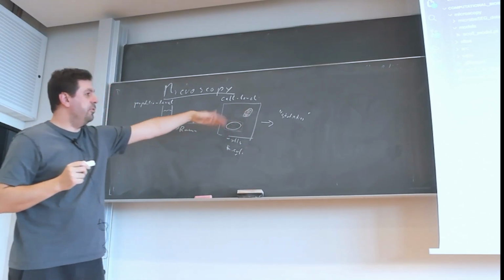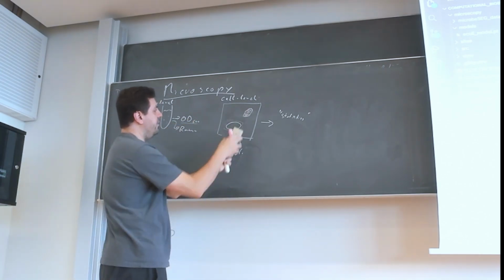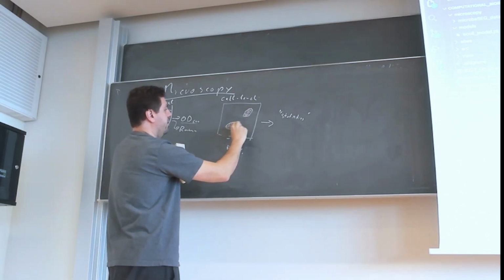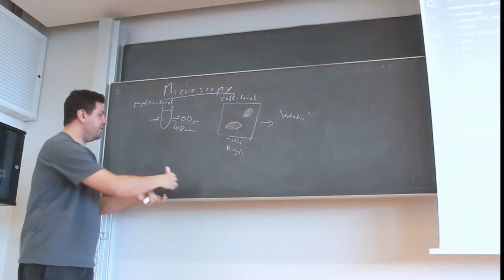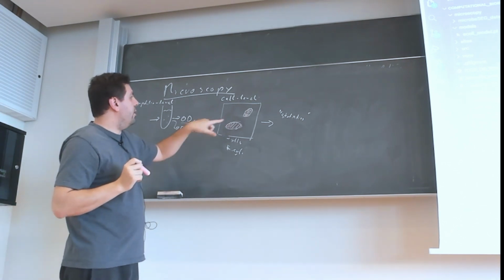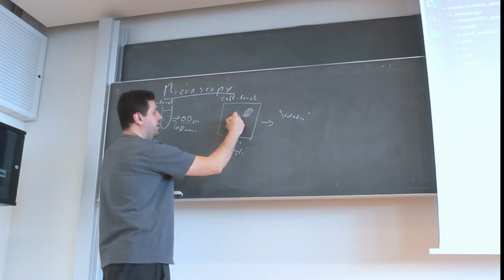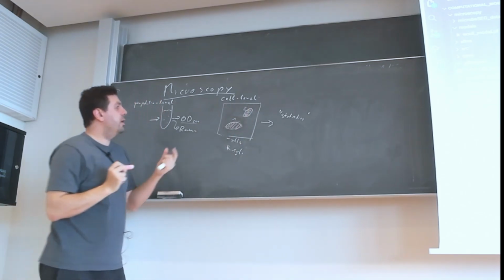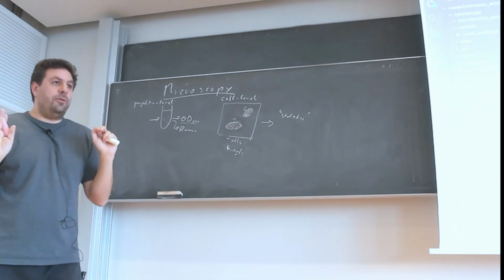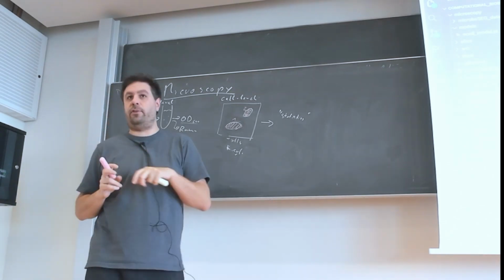Segmentation also comes in two small aspects, and we will look at both. In pixel level segmentation, which we are going to look into, you could label this and this pixel with the same label. So you could just say this pixel and this pixel belong to a cell, and that's it. Or you could label individual cells differently. This could be labeled with the value 1, and this with the value 2. So you know that this pixel belongs to a different cell than this pixel. And we are going to look into both. For some aspects, you don't care about the individual cells, and sometimes you do.